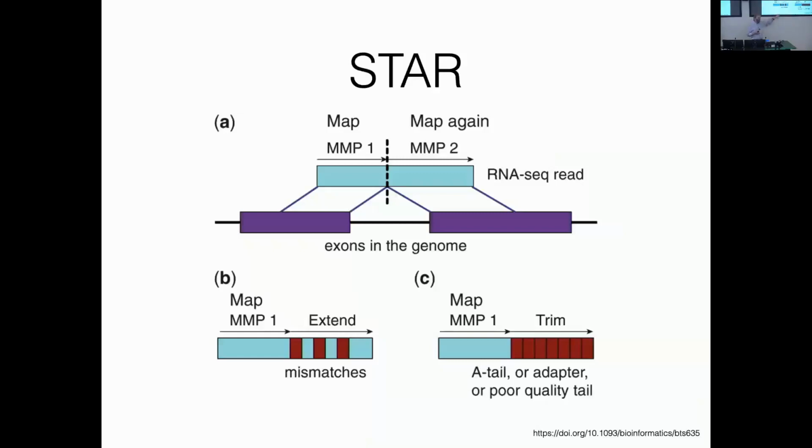So there can be mismatches in part just because there's genomic diversity. You can get away without doing any of this, but you're going to lose some data. So it's usually a good idea to use software that can handle these different issues, and that's what we're going to do.